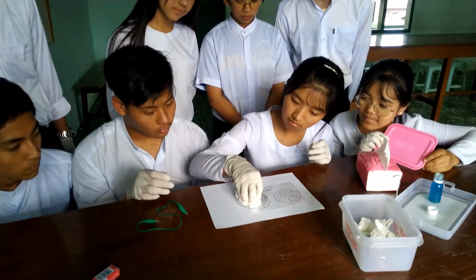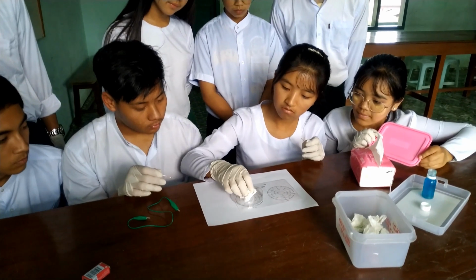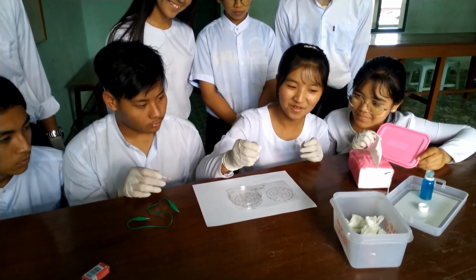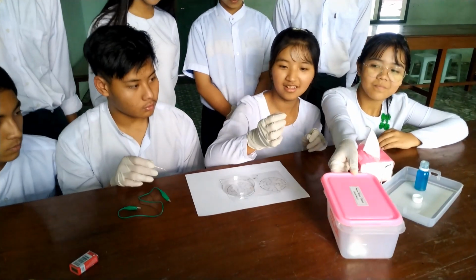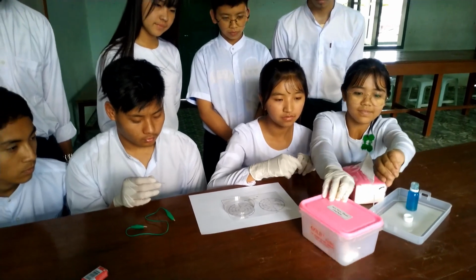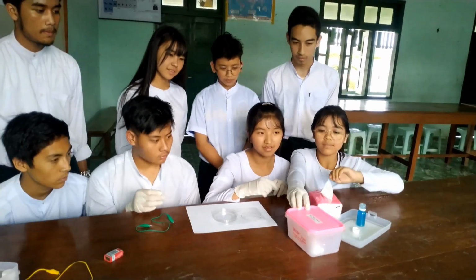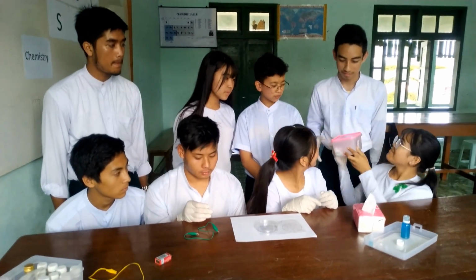After the experiment, clean all equipment with purified water and make sure to put the waste in the rubbish bin or destroy it systematically so that there is no harm. In our school, we always have a rubbish bin for chemical waste, and we also destroy the waste systematically after that.